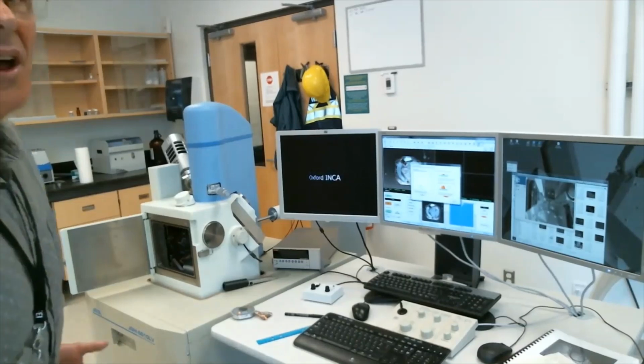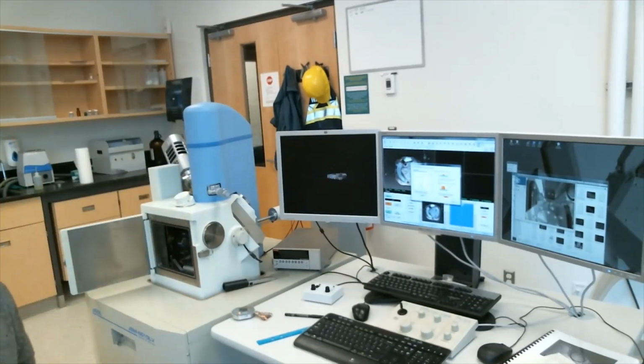Anyway, it's got an enormous sample chamber, which means that we can put very irregular samples into this chamber.